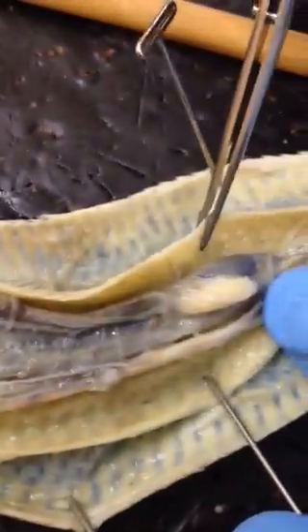This here, going all the way down — this whole thing, all the way on the sides and the other side, is all muscle.